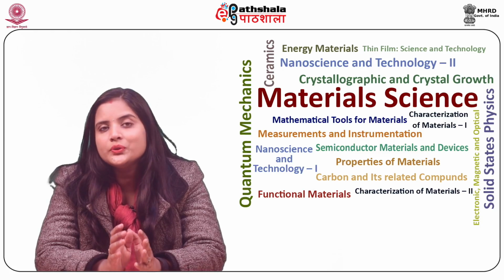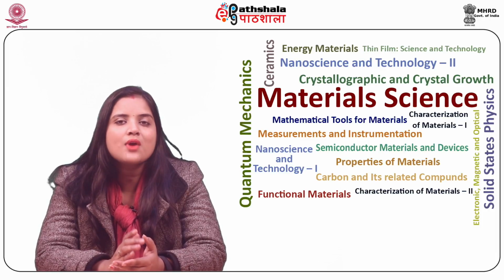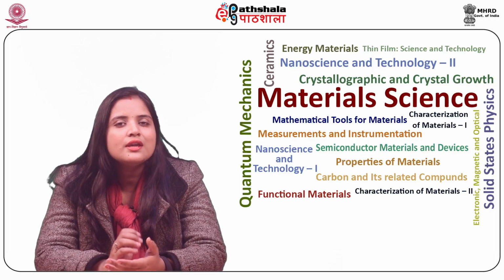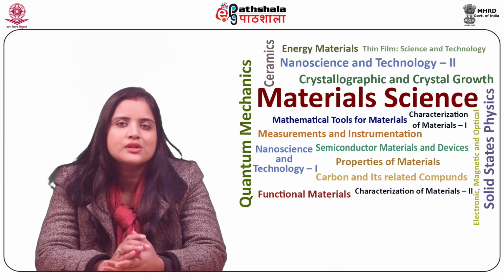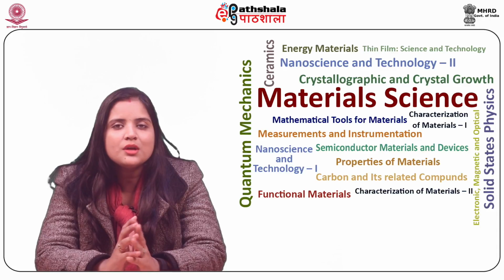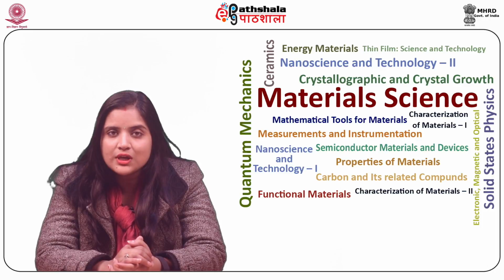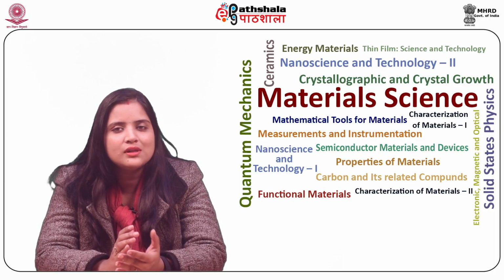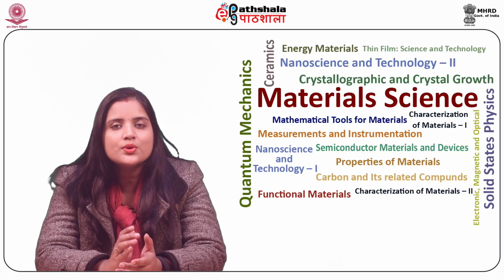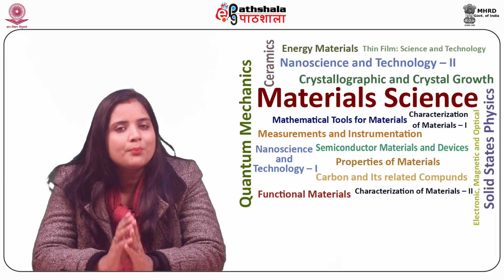Let me first introduce you to electron probe microanalyzer, which is also abbreviated as EPMA. Castaing established the basic principles of quantitative EPMA. The first commercially manufactured electron microprobe was made available in the year 1958 by a French company. It is also known as electron microprobe or simply probe.